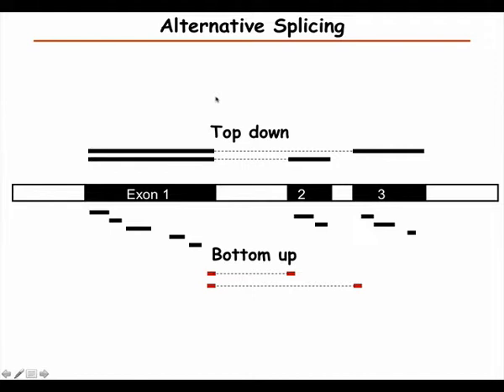The problem, of course, is that now you have to work with proteins, and they don't behave as well in chromatography as peptides usually, and also they're larger, so it's difficult to deal with them in the mass spectrometer. And some proteins are very hydrophobic, so it's not easy to not lose a large fraction of them.